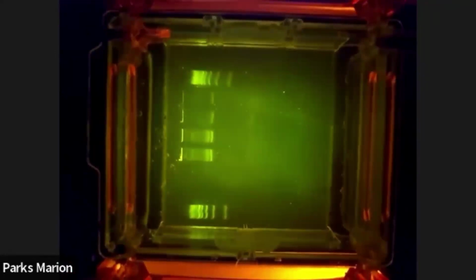We've got pretty great separation now after that 45 minutes has passed. We can see our ladders on either end. Our negative control, our blank, positive control, and our experimental sample. You'll discuss with your instructor what this gel is showing.